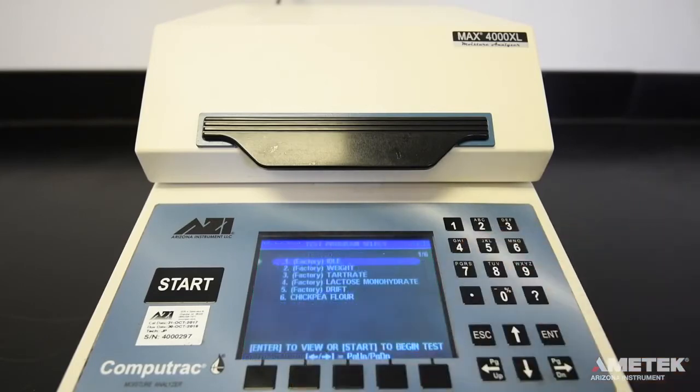In order to perform a test on your CompuTrack Max 4000XL or Max 4000, you must first select the correct test program. From the main screen, press the program button. This will take you to the program list. Use the arrow keys to the right of the screen to select the test you wish to perform.